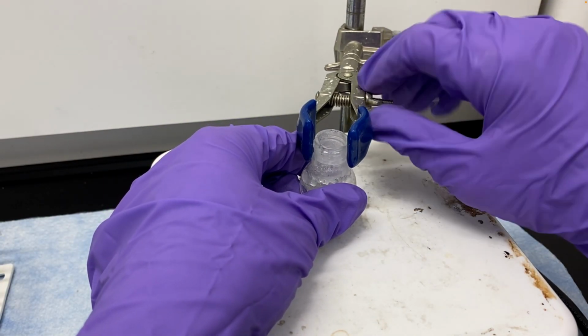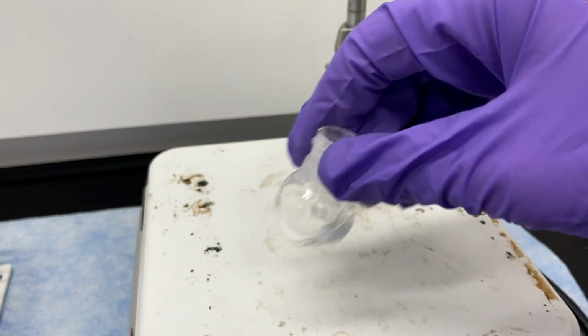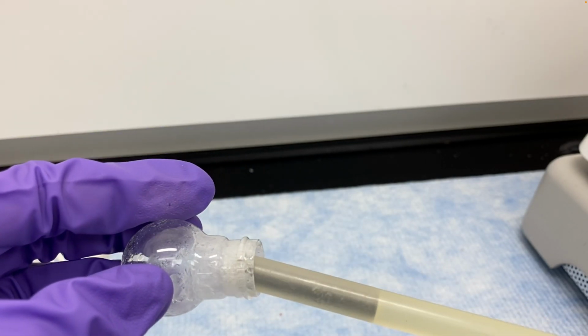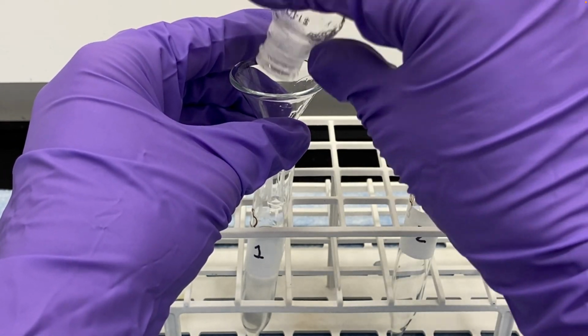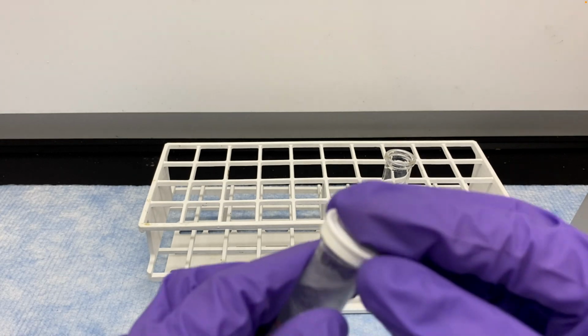So you can remove that round bottom flask, shake that up. You want to try to get as much to dissolve as you can. I have a magnetic stir bar retriever here. That's just a wand with a magnet at the end, and you can see that will pull the magnetic stir bar out of the reaction flask. So now you have your funnel, swirl, pour, trying to get everything you can out of that reaction flask.